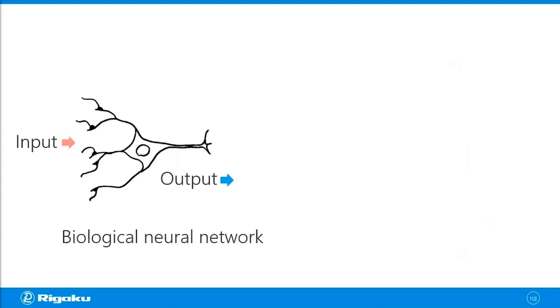And you can look at another face and say, oh, that's Stacy, or I don't know that person. And we can do this all day long. It's really easy. But if you were to sit down and write code to recognize somebody's face as George's or Stacy's, that is not a trivial thing to do.